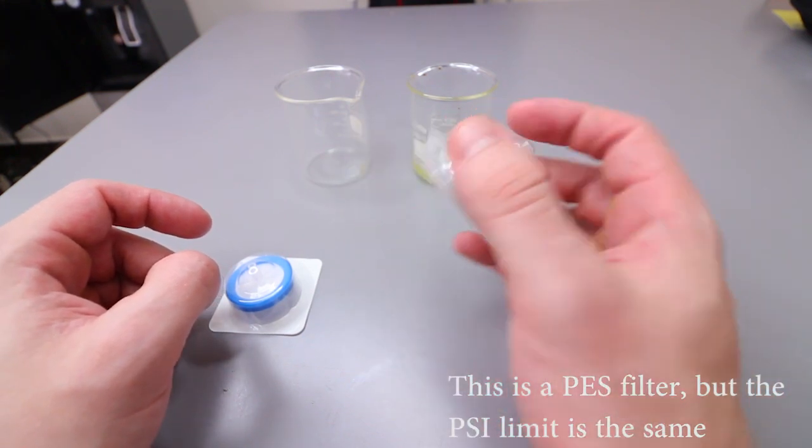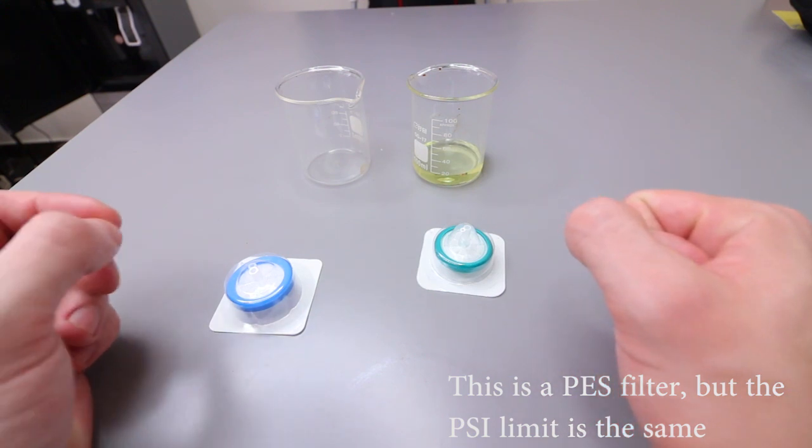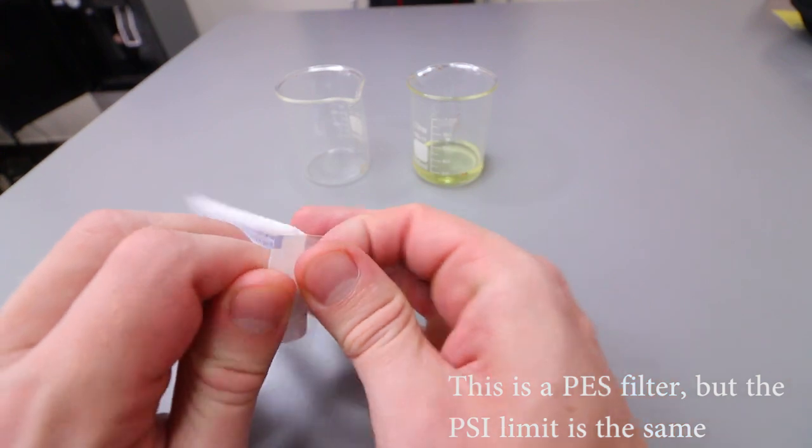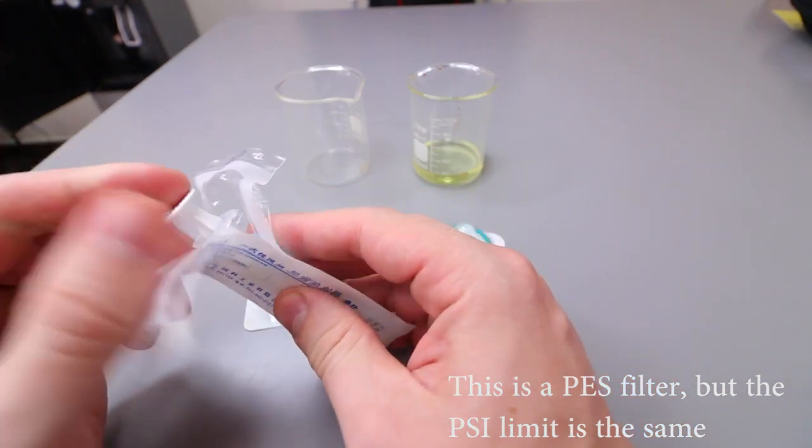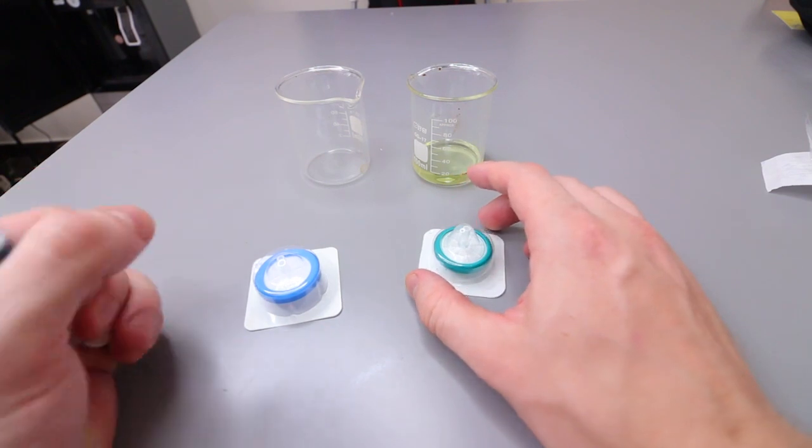They're a little bit more expensive. I think we're selling a 12 pack for about 30 US dollars at the moment, and you can find some filters that are a little bit cheaper on Amazon or eBay. I just want to show you one of the reasons why it is better to get a slightly more expensive filter.